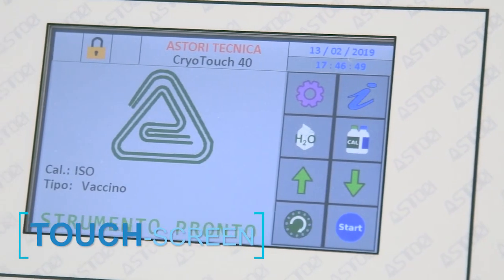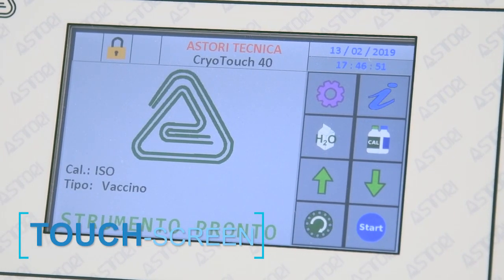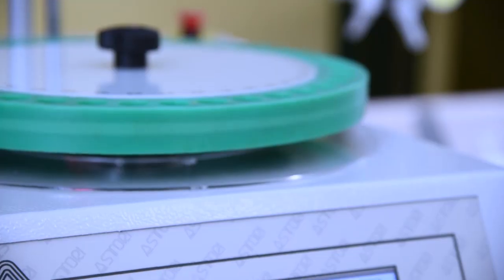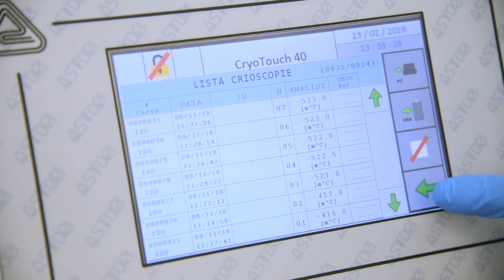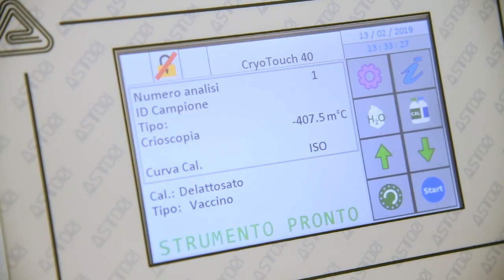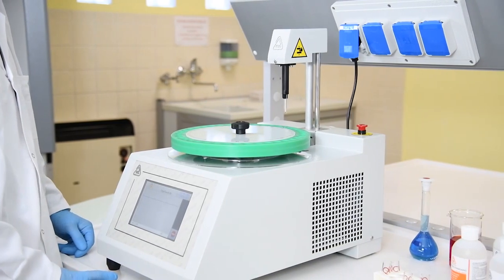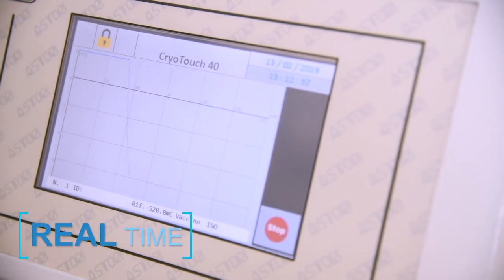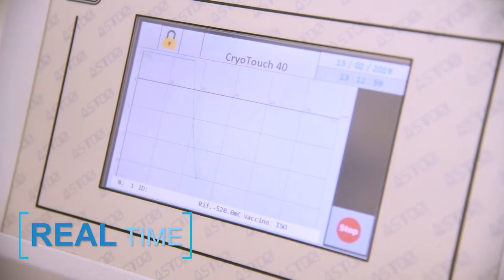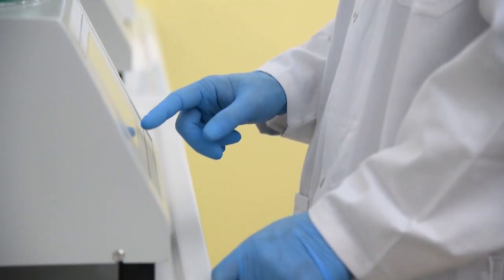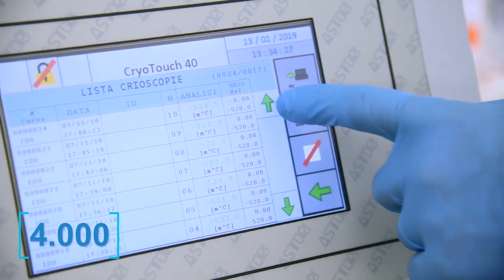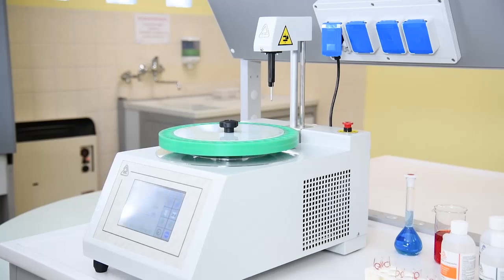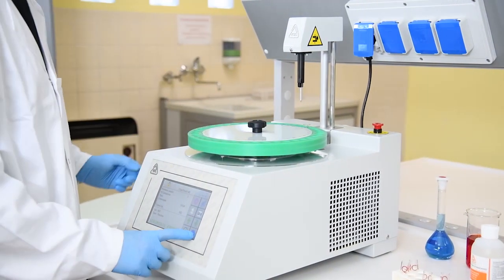A wide touchscreen full-color display with an icon-based menu simplifies the operations of analysis, calibration and data handling. A quick touch allows easy access to all functions and immediate switch from calibration to analysis mode or other screenshots. The temperature measurement of each sample is shown in real-time by drawing the graph up to the freezing plateau and pointing out any possible error. It is very easy to recall the last 4,000 test results and complete data, such as sample name or code, date, time, cryoscopic point and added water percentage.